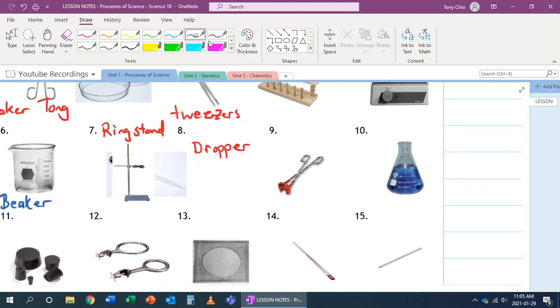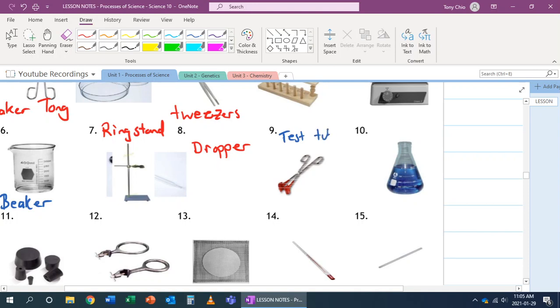Number nine. Number nine is what we call a test tube tong. It's used to pick up a hot test tube. Again, just like the beaker tong, it's rubber-tipped.